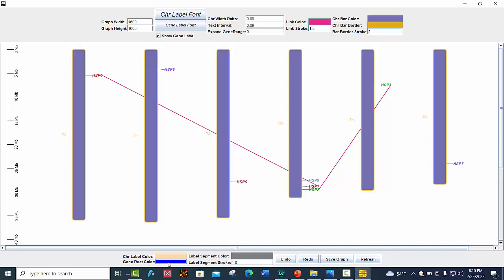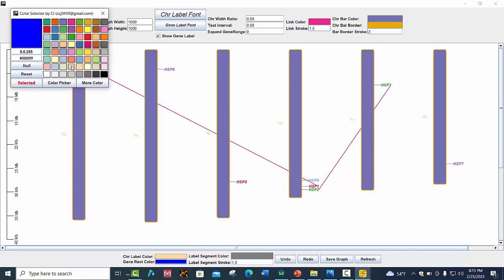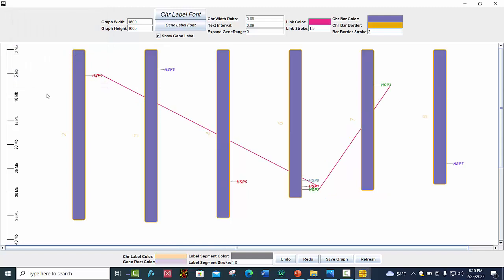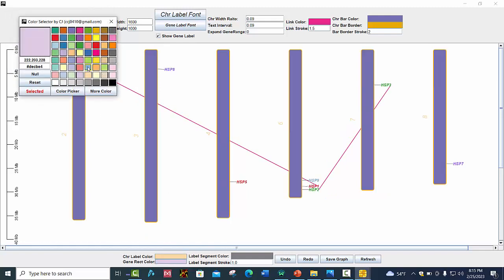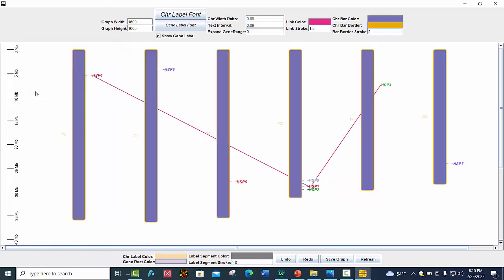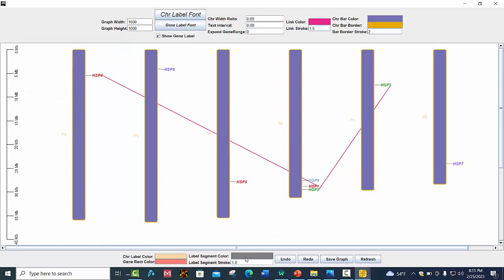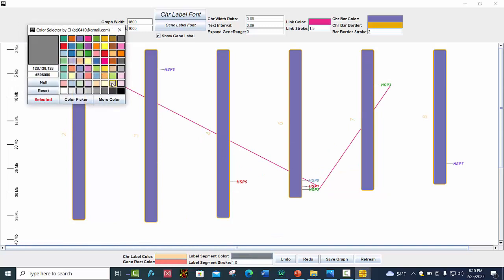You can also change the gene color by clicking on it and choosing whatever color you are interested in. You can also change the segment color here.